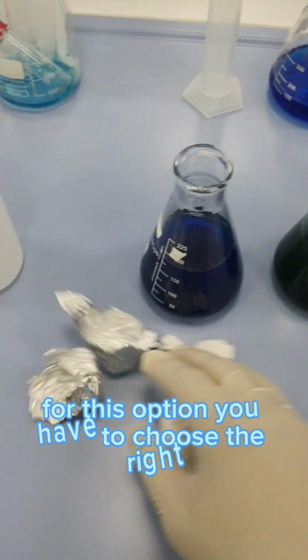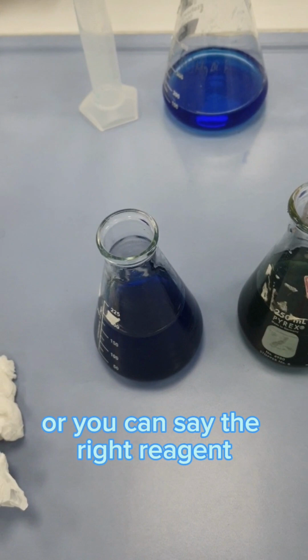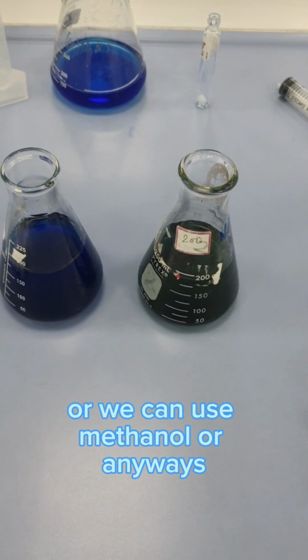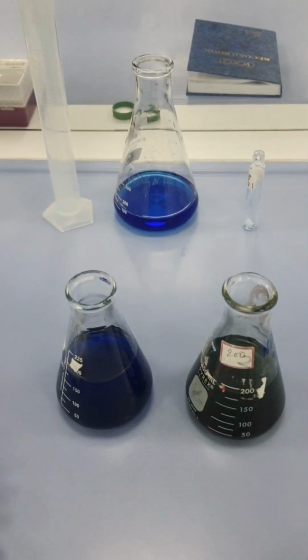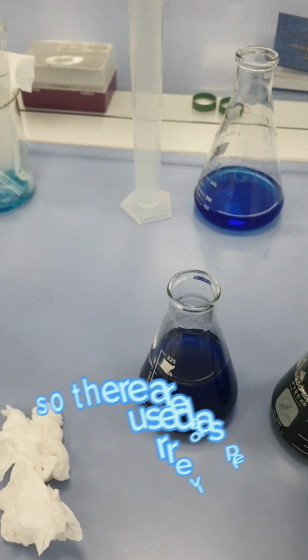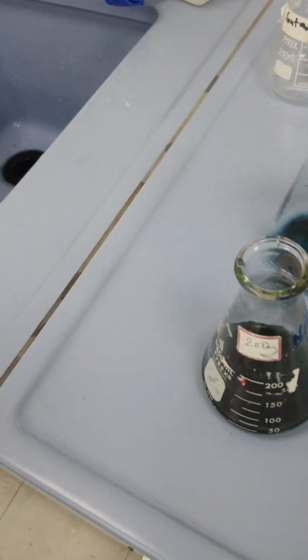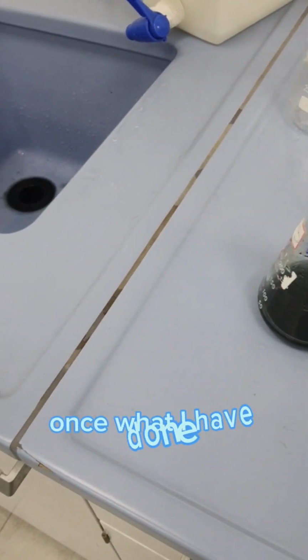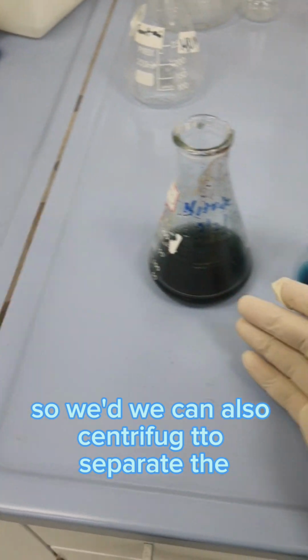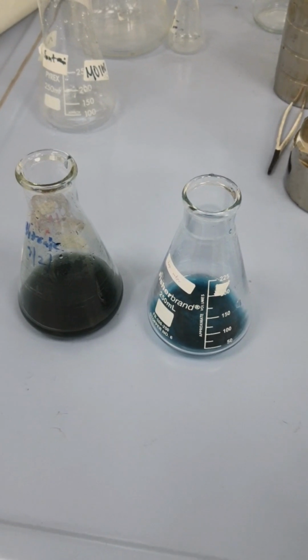For desorption we have to choose the right eluent, or you can say the right reagent. In this case I'm using methanol, or we can use ethanol or NaOH, or also we can use combinations like NaOH plus Na2CO3 or NaOH plus sodium bicarbonate. There are a lot of eluents used as per the literature review. For both of these, I have decanted. We can also centrifuge to separate the adsorbent from the liquid solution. I've just simply decanted, removing the top layer.